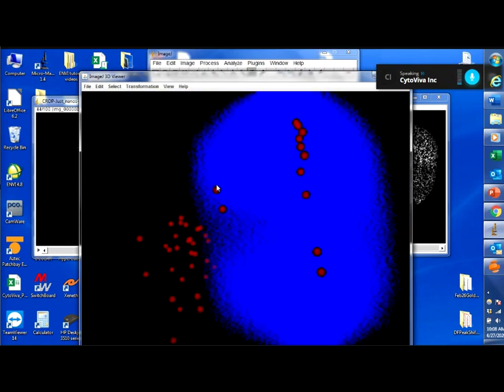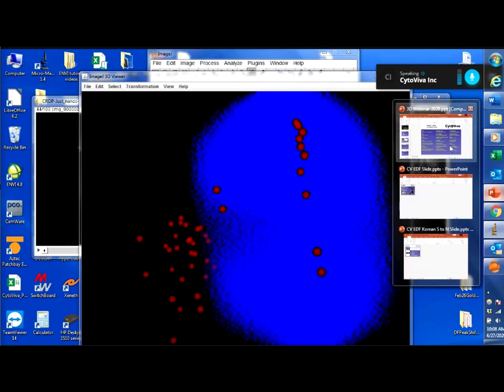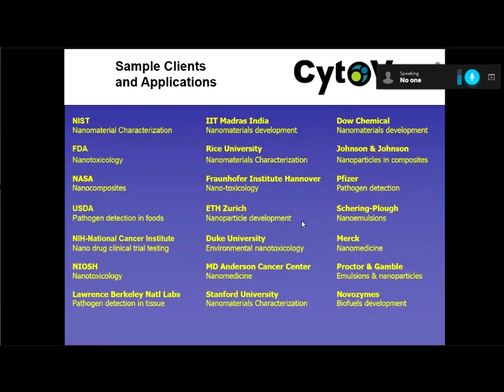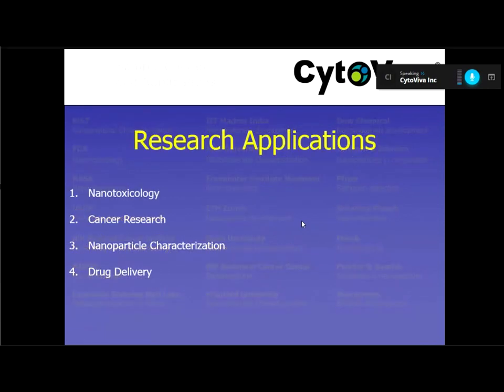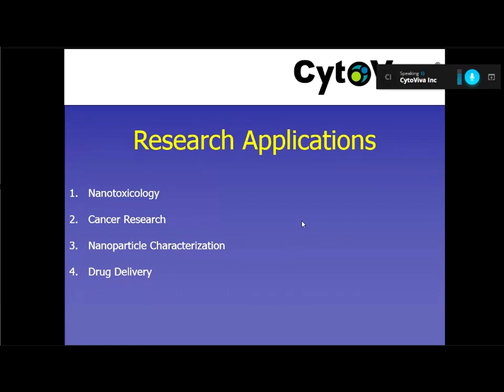This is the end result of what we saw in that video — not the same sample, but the same idea. We have a cell with a nucleus and some particles, and we want to know: are these particles inside the cell, or inside the nucleus? That's what this particular researcher wants to find out. The research applications this technology can apply to include nanotoxicology, cancer research, nanoparticle characterization, and drug delivery.